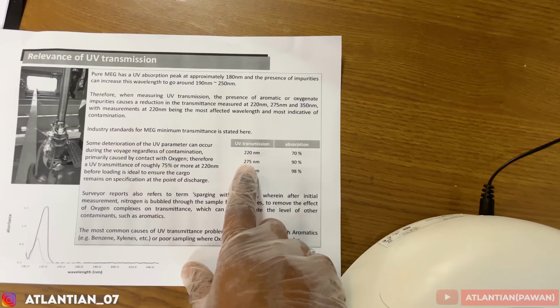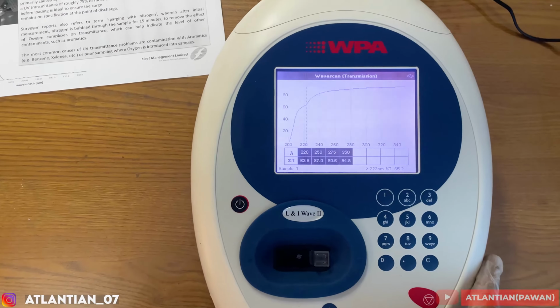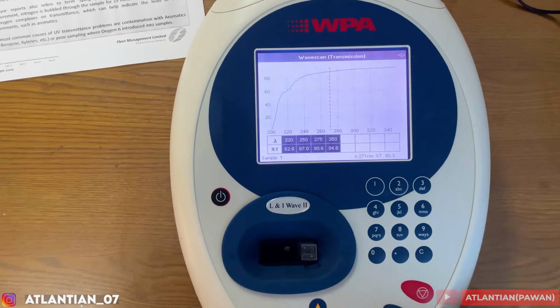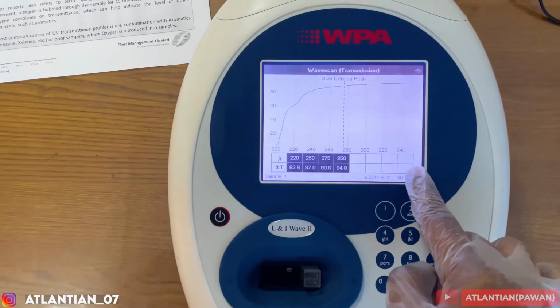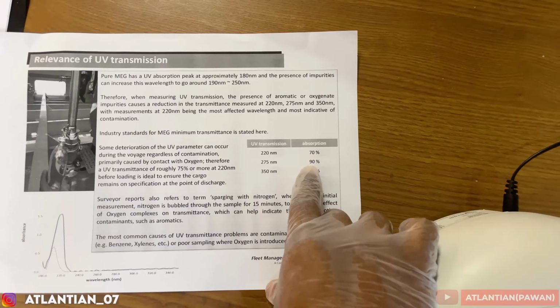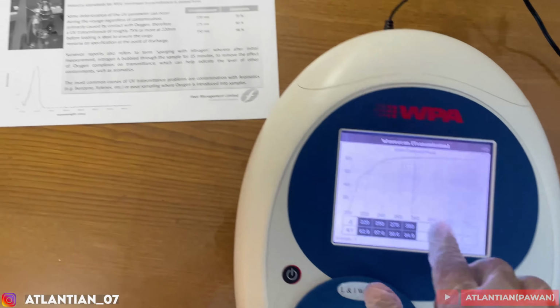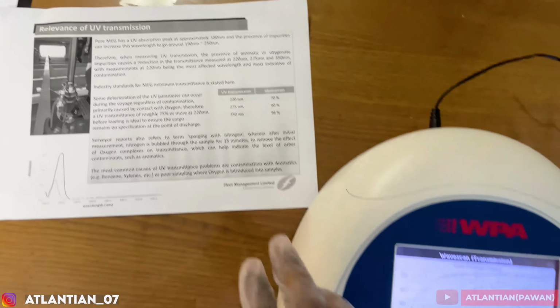If you want, you can check others also. Here you can read the wavelength if you want. At 275, it should be something around 90. In our sample case it is showing 90.6. And the same thing at 350 nanometer, the UV transmission shall be 98.